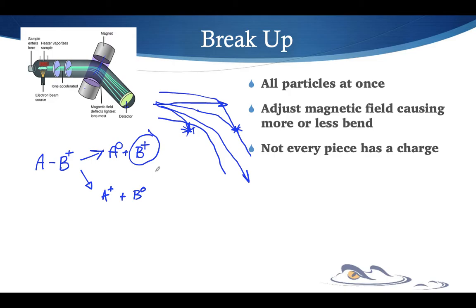So there are certain peaks that are going to show up in mass spectroscopy, and those are the ones that we kind of let our eyes take a look at. Those are the peaks that are going to be those tall peaks. So we try to make a little sense out of the tall peaks, and the other peaks, we can't always figure all of them out.